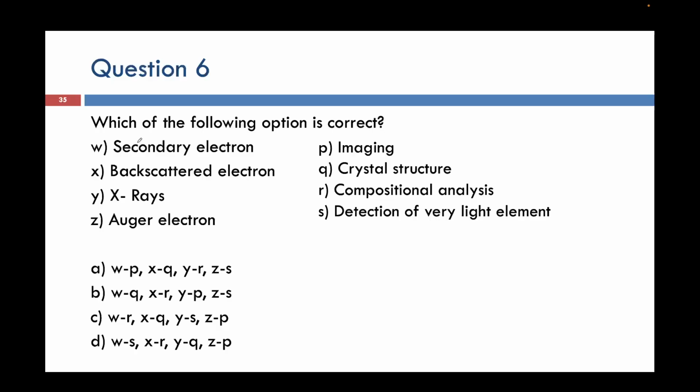In the last class, there was a question, I think question number 12, which was which one is used for grain orientation in the SEM. I think many of you told that the BSE is used, and that was the correct answer, but I told that SE was used, which was not correct. So that was a mistake from my side. I apologize for that.